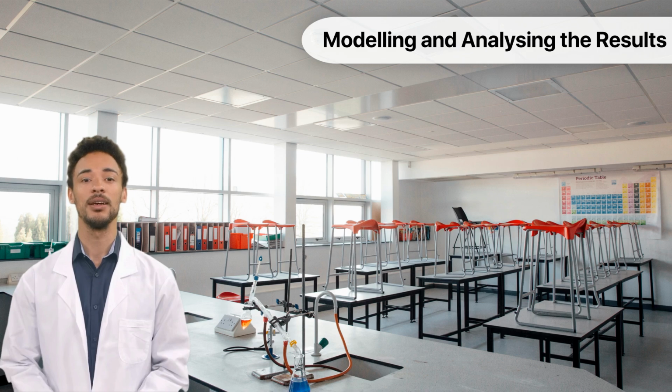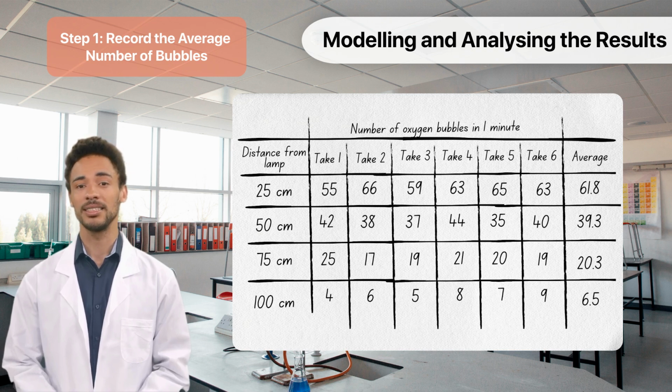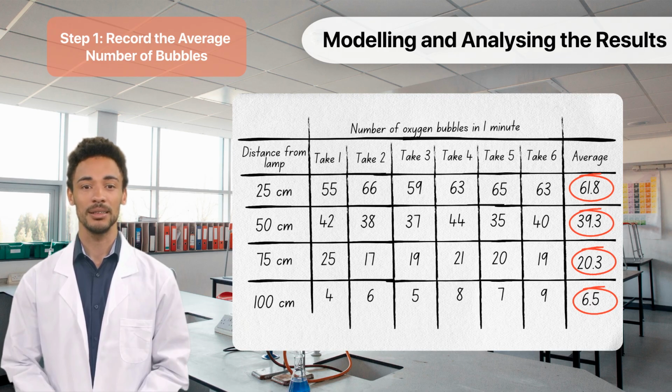To analyze the results, follow these steps. Firstly, record the average number of bubbles. For each distance of the lamp, which correlates with different light intensities, note down the average number of bubbles produced per minute.